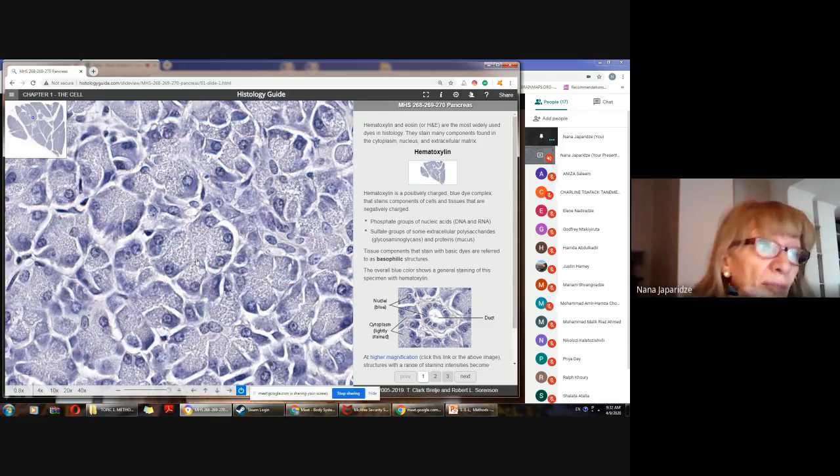And because these are secretory cells, and because you see a lot of dots in the cytoplasm, first of all, these might be very well developed rough endoplasmic reticulum. Look, this is a much more dark stained portion.